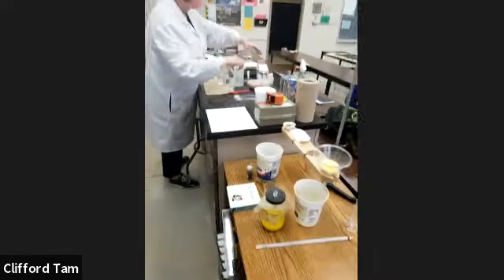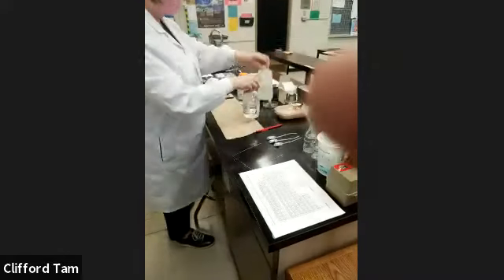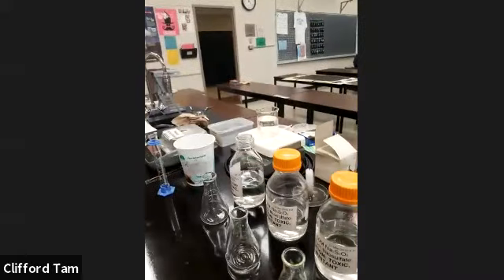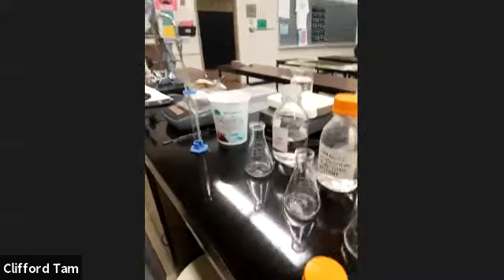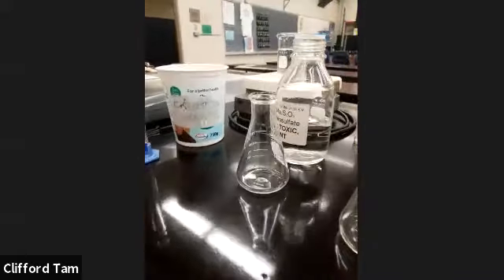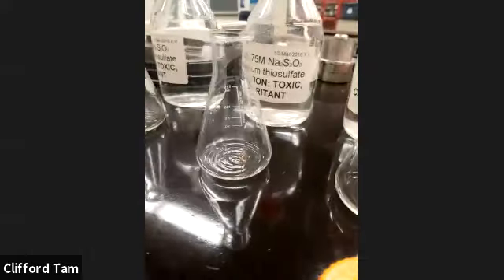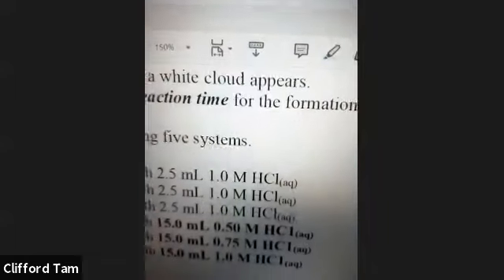Yep. So guys, I want to put you on hold for now. Just let me go ahead. So we're going to put 20 mils into this one, and we're going to time it to make a precipitate. What's important to remember here is that in these flasks that I'm filming for you guys right in front of me, that is the HCl, that 1 mole of HCl.